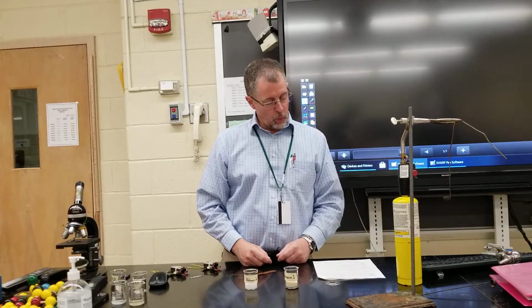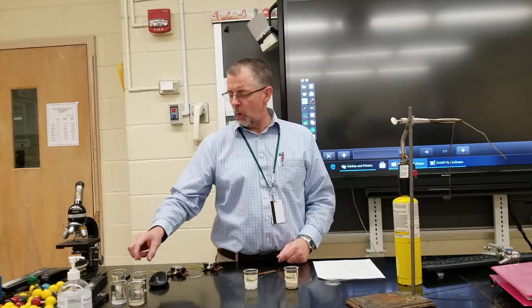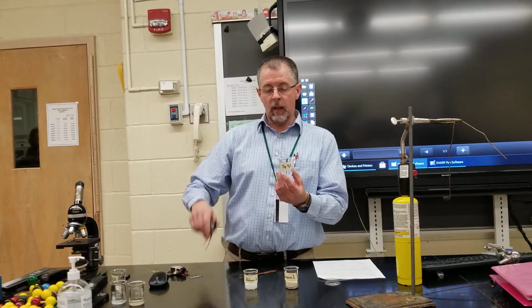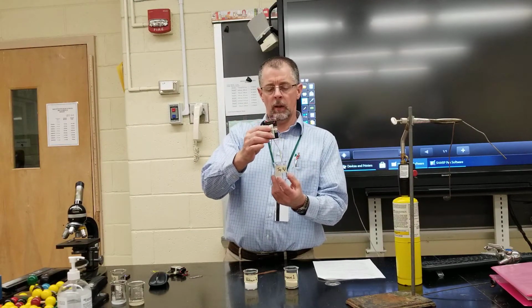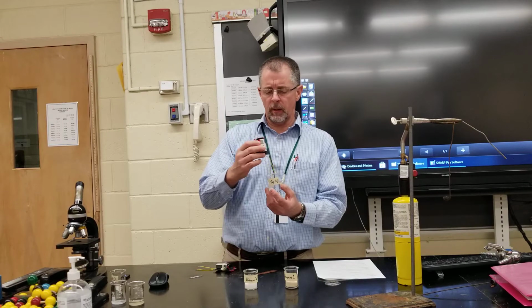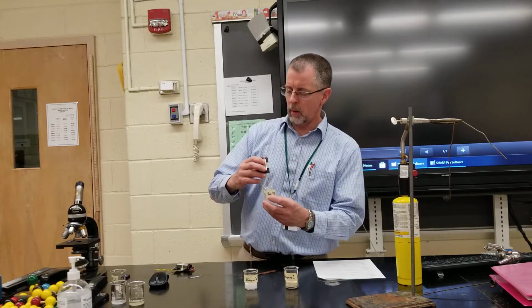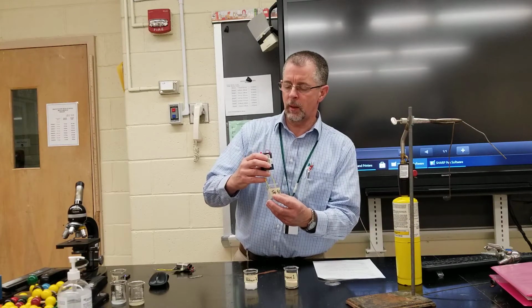Moving on to part 3, the conductivity of tap water. Tap water is water that simply comes right out of the faucet, and we put the conductivity meter in there, and we see, actually let me use the other one, we see that it does light up slightly. I don't know if you can see that, it's very dim. Yes, it does light up very, very slightly, but it is pretty dim.